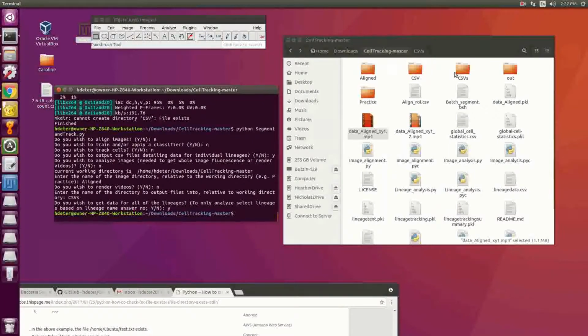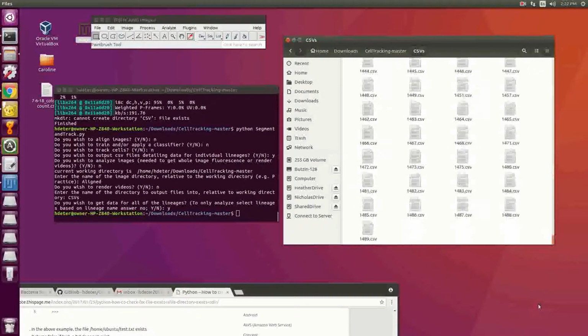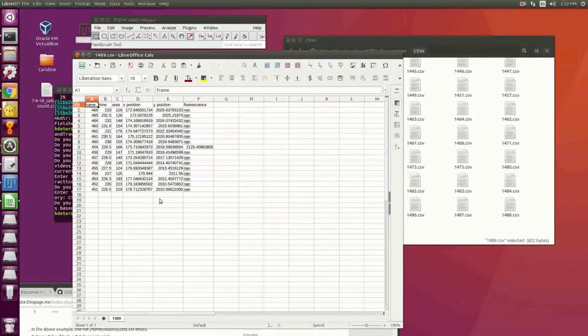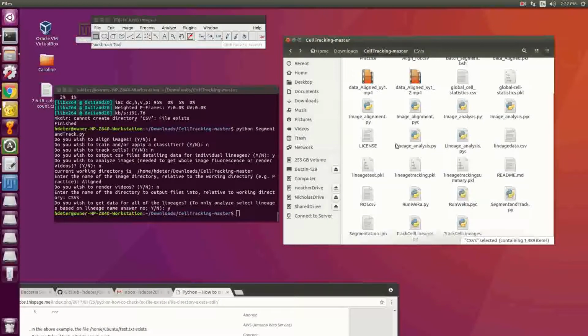You can see it's an extremely quick process. I now have 1,400 files. You can go ahead and take a look at all of the files. Very useful. Or write another script to look through them for you. That's why Python is neat. So that's how that works.